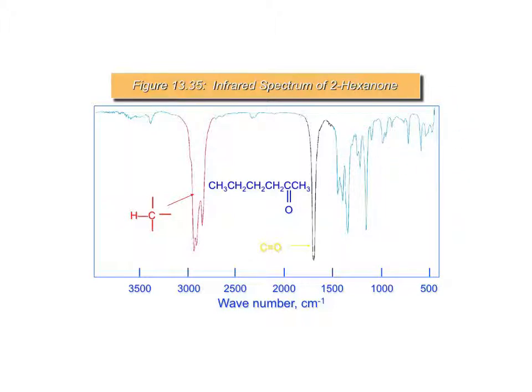This is the fingerprint region, and then where the alcohols are. Otherwise, I'd give you the table and have you match it up and say, okay, this one's got the peaks for the alkene, this one wouldn't, or this one's got the peaks for an amide, and this one doesn't. Of course, you still have to know what your functional groups are in order to do well. But are there any questions right now over IR?